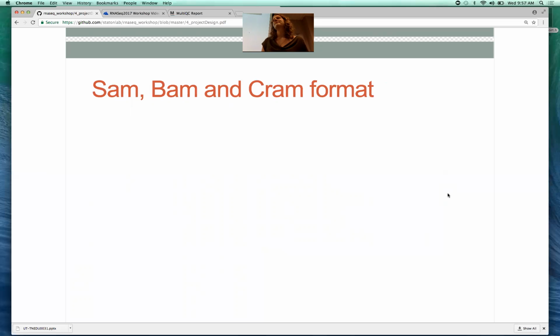The motivation is to save money. If it's a $250 library prep fee, you're going to take all 8 of your biological replicates and pay once instead of paying $250 for each replicate. It's just super expensive to do the reps.